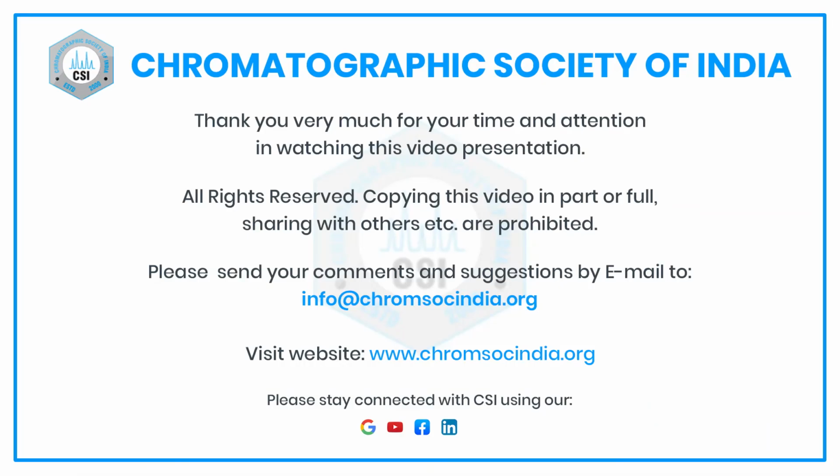As I said, Orbitrap is one of the latest. In the last 20 years, a very important development has been the Orbitrap, which many people are using. India is also blessed with having so many Orbitraps here. It costs several hundred thousand dollars, but it can do low molecular weight compounds, high molecular weight compounds, biological molecules, everything. So if you have plenty of money, the Orbitrap is a very good instrument to go for.